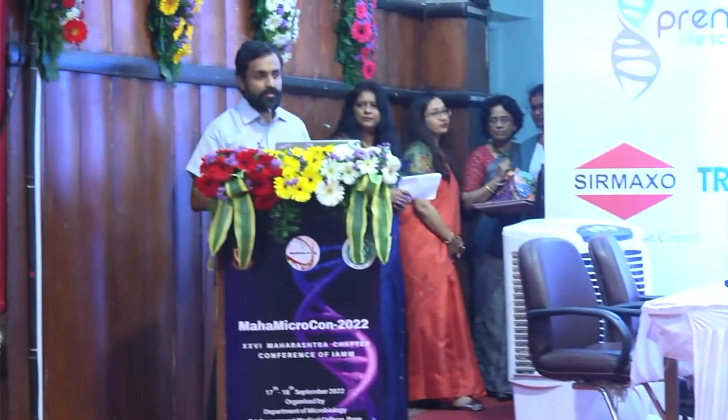So the next generation sequencer output is a FASTA file with qualities, and that's what is called a FASTQ file. And the FASTQ files are essentially raw data. It is not assembled. It is just out of the sequencer. Once you take the FASTQ files and assemble them, either using reference-based assembly when you know what the reference genome is, or a de novo assembly when you don't really know what the virus or the organism is, then you could construct the genome of the organism, which is represented in a FASTA file, which doesn't have qualities, but is necessarily the sequence of the genome, right?